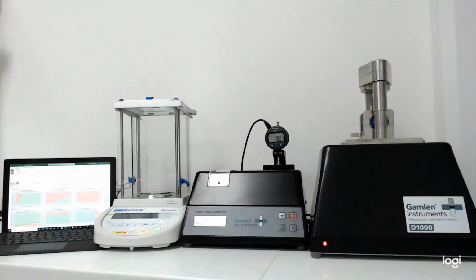I'm going to show you a video now. I'm just going to open it up from the panel. So this is going to be a video of the instruments actually in action. So you can see there, that's the full set of instruments you need for compaction analysis on the bench. They're all quite small and portable. They don't take up much lab space.